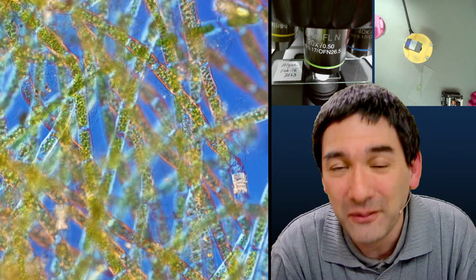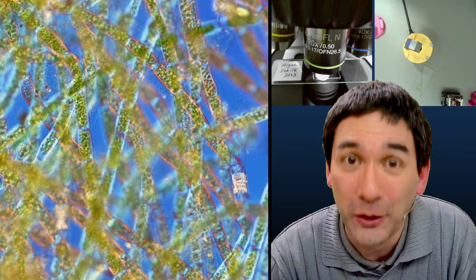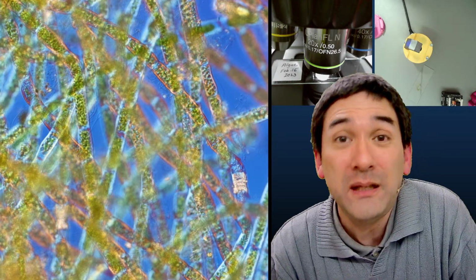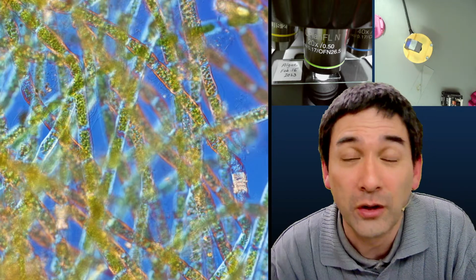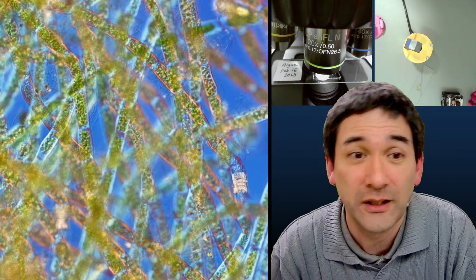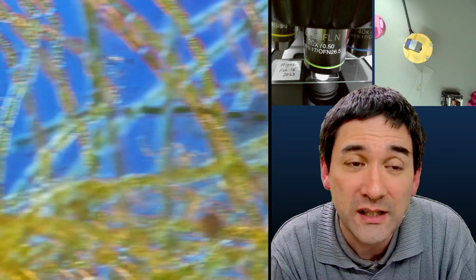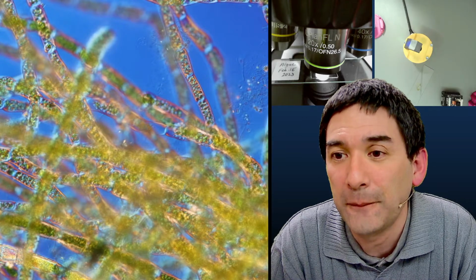Do you want to distinguish the different car brands, or are you just happy with the general term car? And there are certain characteristics that are completely meaningless. For example, if you wanted to identify different cars, then the color of the car is probably not so relevant. We have the same thing with a microscope, that certain characteristics are simply not as relevant as others.